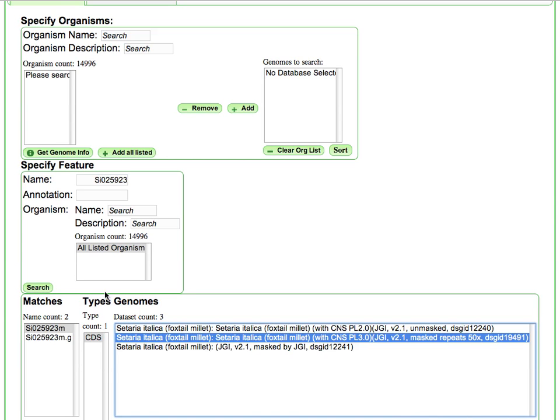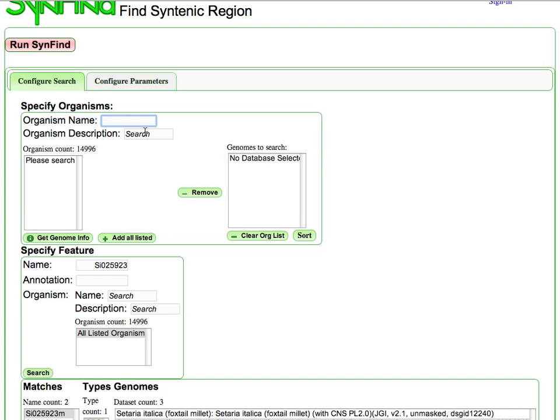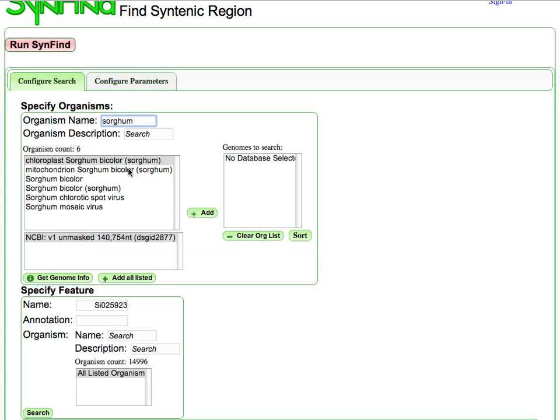And then what I'm going to do is I'm going to use that genome and search it against, in this case, the genome of Sorghum. And so I'm just going to search for Sorghum, and I'm going to again select the masked version of that genome.